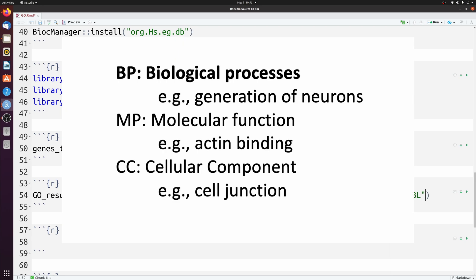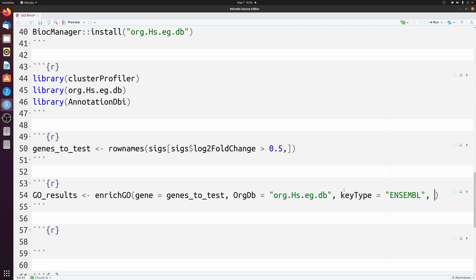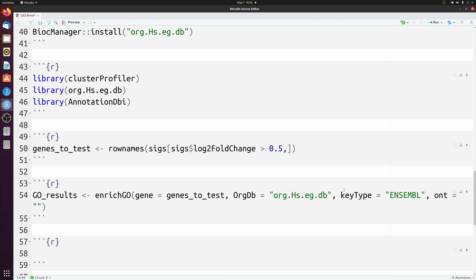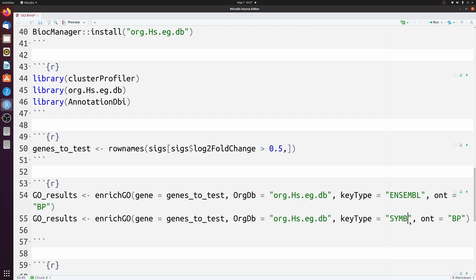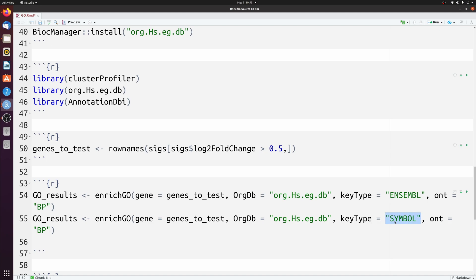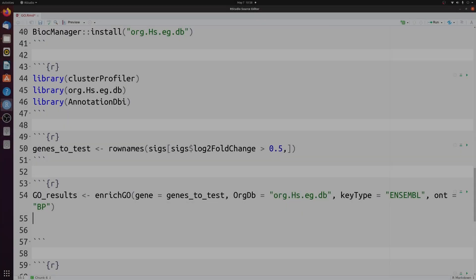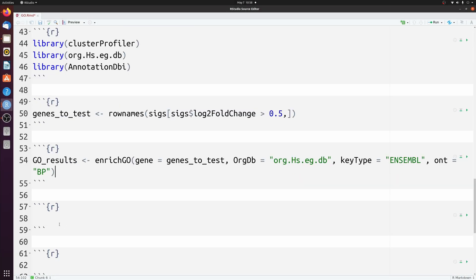There are three different classes of gene ontology. Usually BP, or Biological Processes, is the one you really care about — the others are rarely that informative. So we pass ont, or ontology, as BP. If you cared about the others, you could pass those too. If you had gene symbols instead, you would change the key type to SYMBOL. For Entrez IDs, change it to ENTREZID. For mouse, change the database to org.Mm.eg.db. Anyway, let's run this — it takes about 30 seconds.